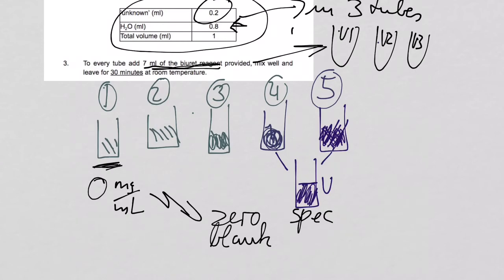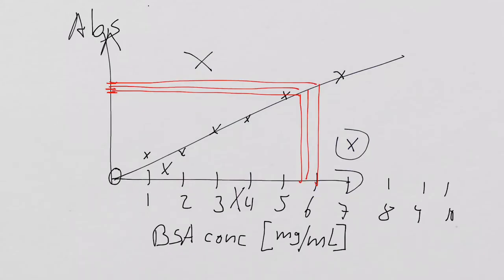And that helps. If it is all of a sudden very pale, there's something wrong. Maybe you forgot to put a biuret in it. Maybe, bless you, maybe you forgot to put the protein in it or something like that. So immediately you see that there's something wrong. But we hope that there is nothing wrong.